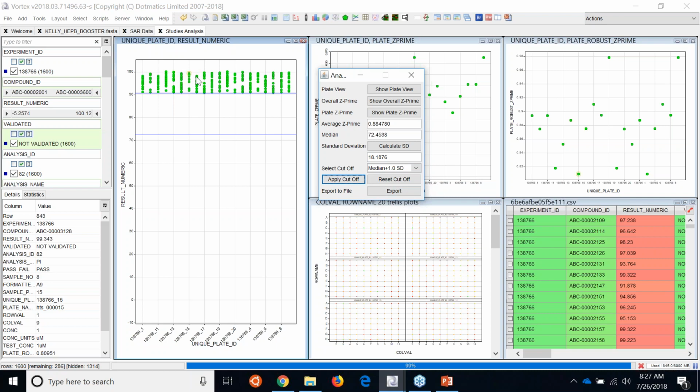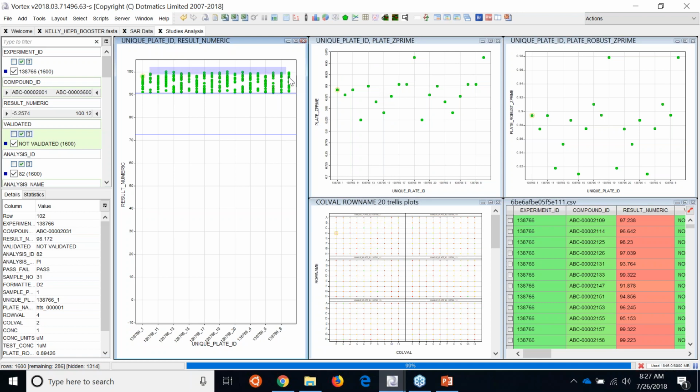So all of the data, if you'd like to cherry pick some compounds, all of the well data is associated with this. You could export a file from there. But what we may want to do is take some of the most active compounds here, and then as Rob was saying, we might want to see what compounds in chemical similarity space are nearest to these that we might want to retest, for example.